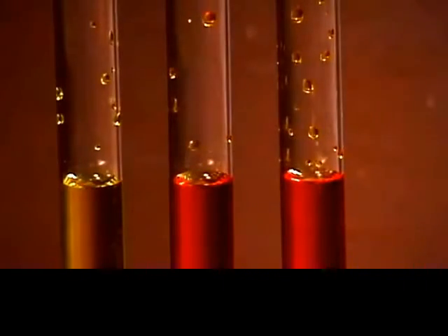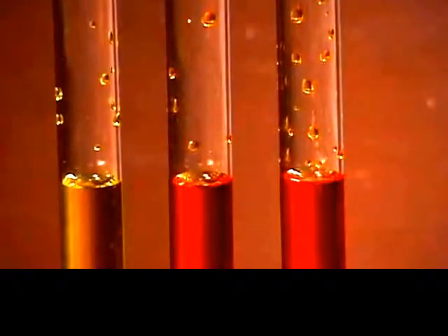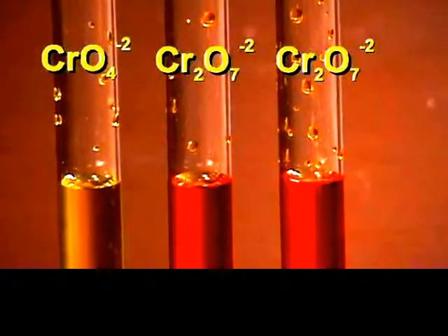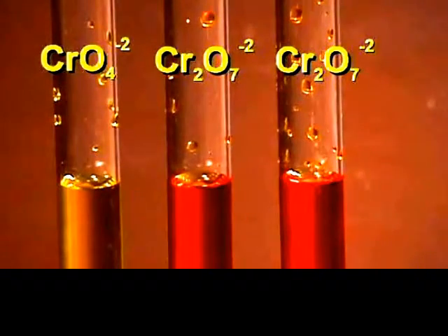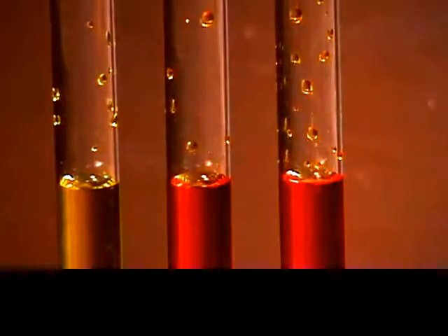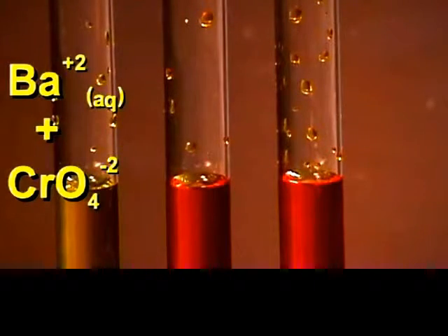We have three test tubes: one containing a solution of potassium chromate, and two test tubes containing solutions of potassium dichromate. We are going to add a solution of 0.1 molar barium chloride to the first tube.